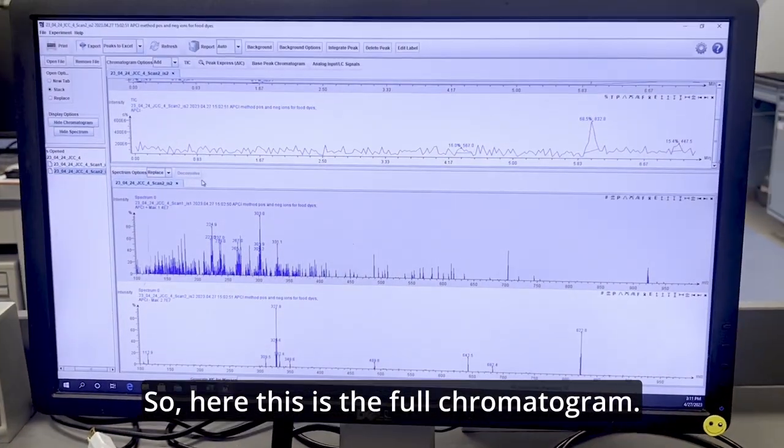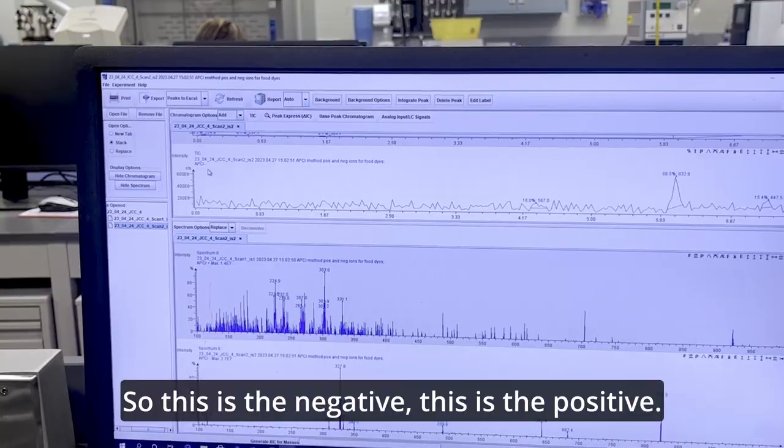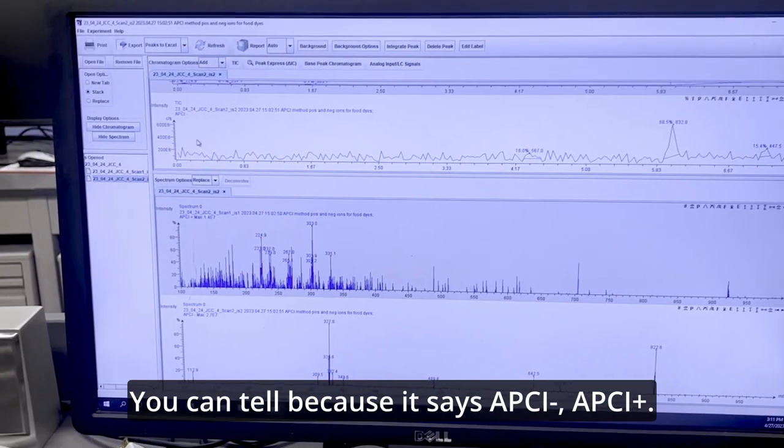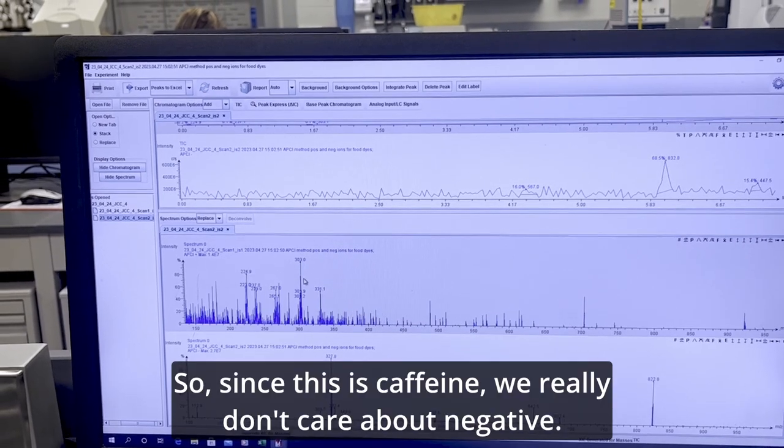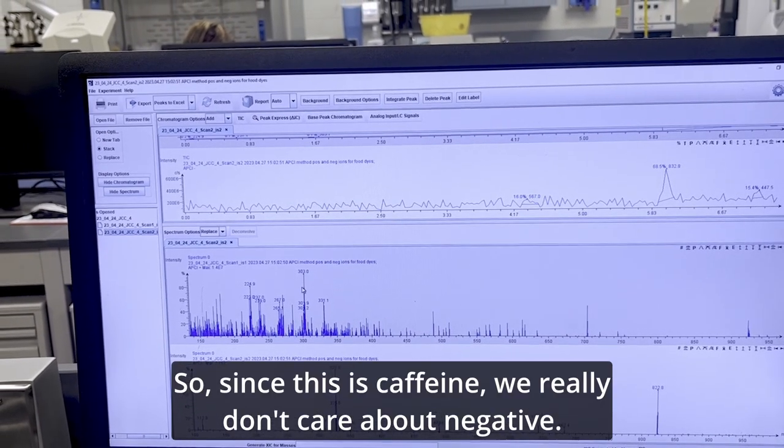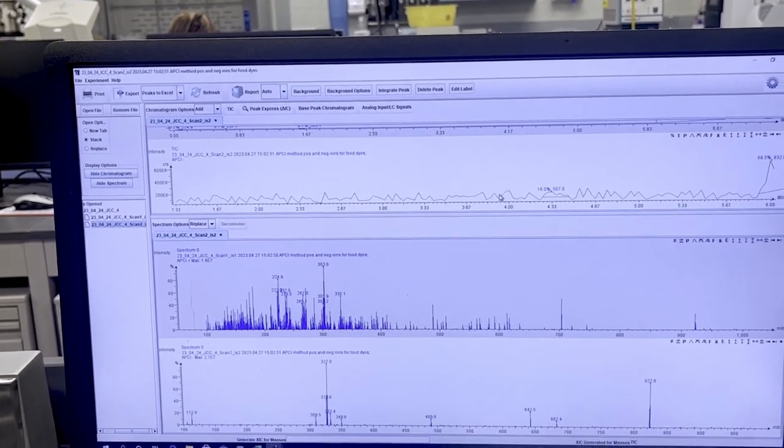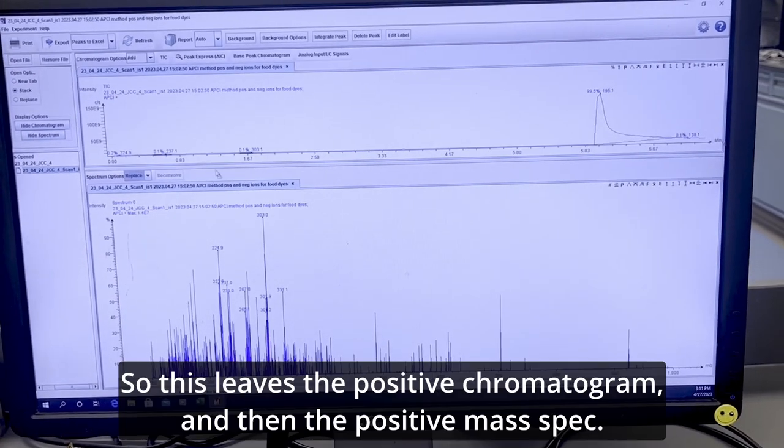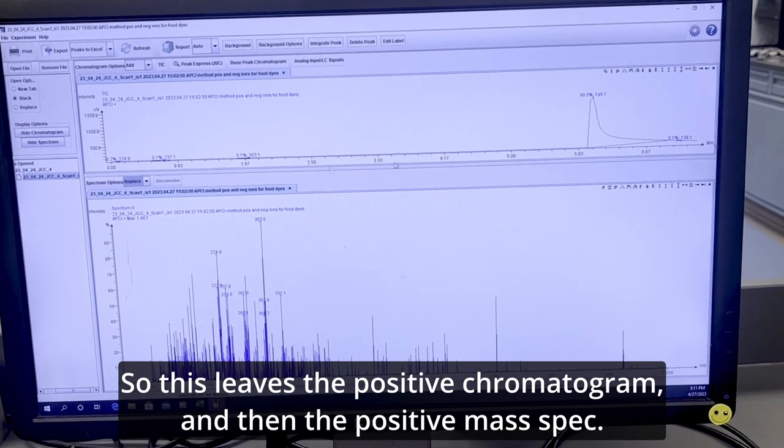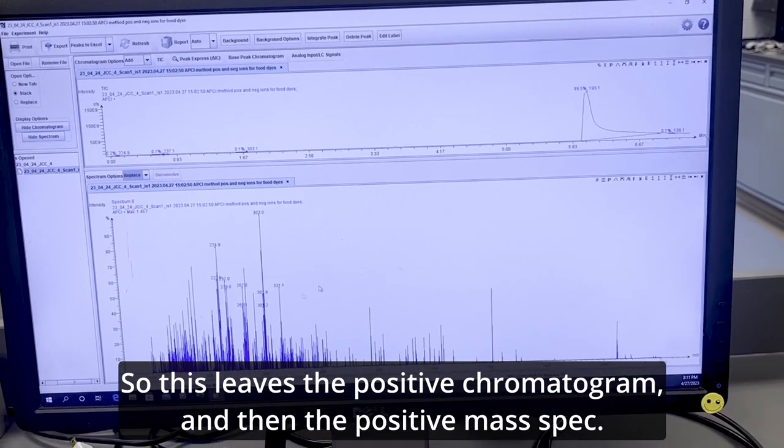So here, this is the full chromatogram. So this is the negative. This is the positive. You can tell because it says APCI negative, APCI positive. So since this is caffeine, we really don't care about negative. So we're just going to X out of what says negative. So this leaves the positive chromatogram and then the positive mass spec.